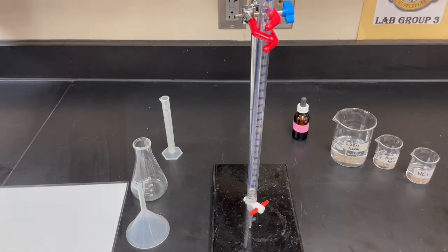Titration involves the addition of a solution whose concentration is known, also known as the titrant, to a solution whose concentration is unknown, or the analyte.